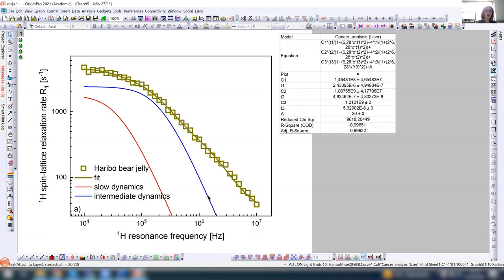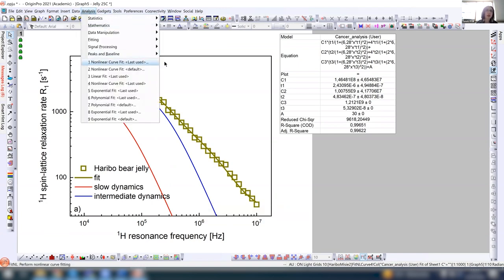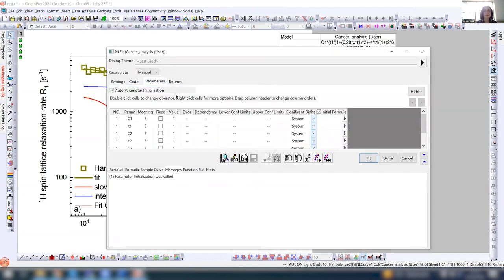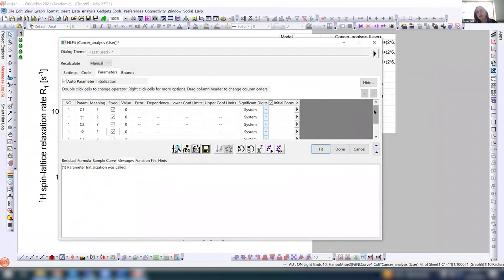And now I can make eventually the last one. So this one is 0, this one is 0, this one is 0, this one is 0. The last factor is also 0.